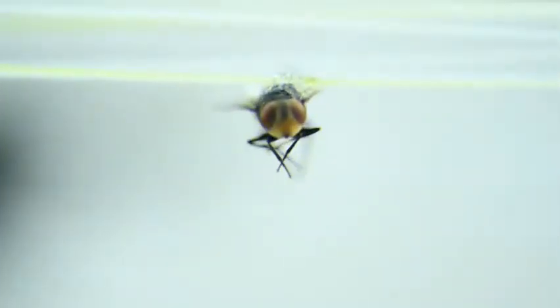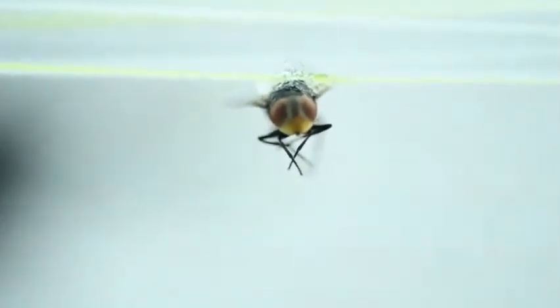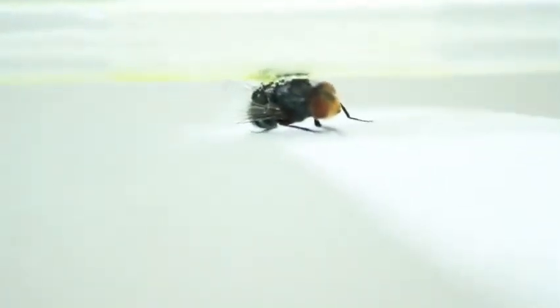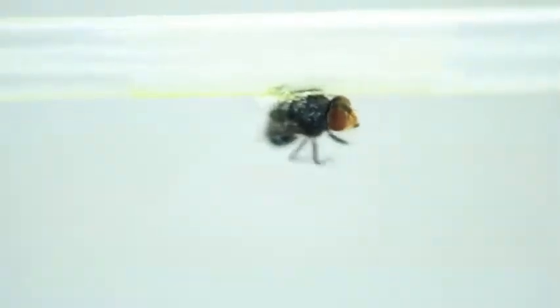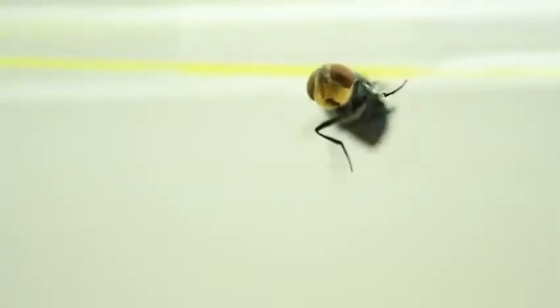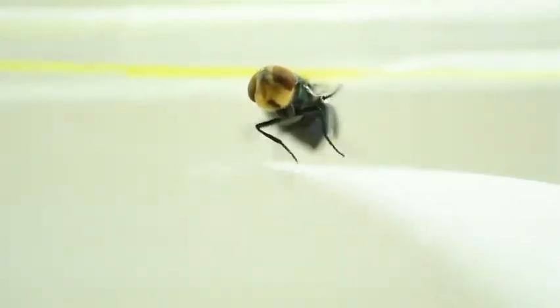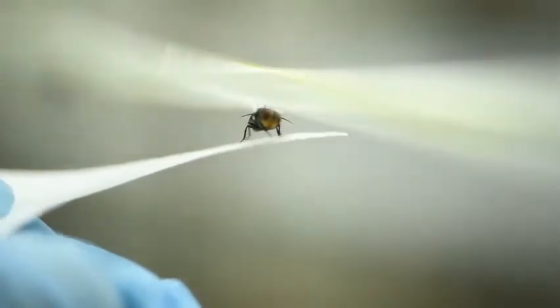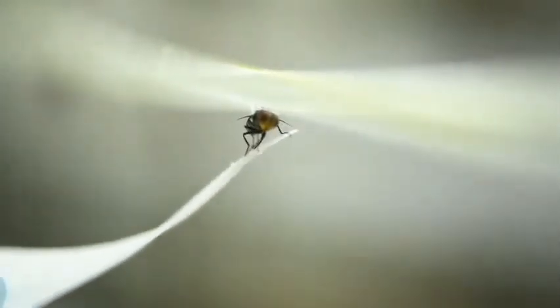Solution of 0.01 mole sucrose, individual 1, individual 2, individual 3, individual 4, individual 5.